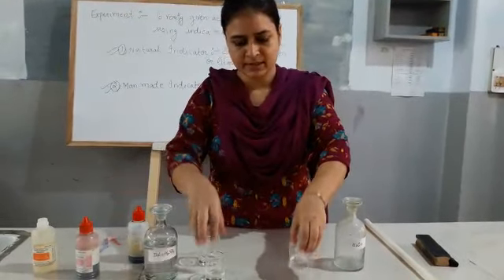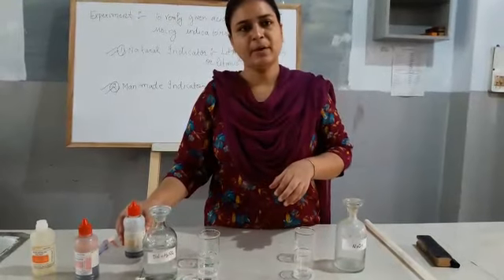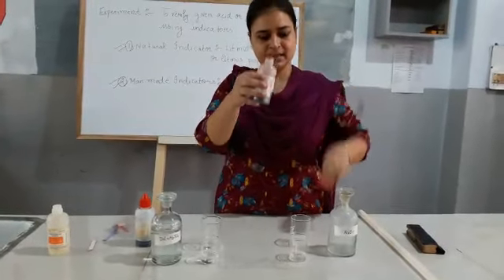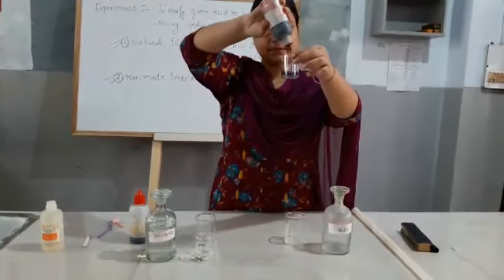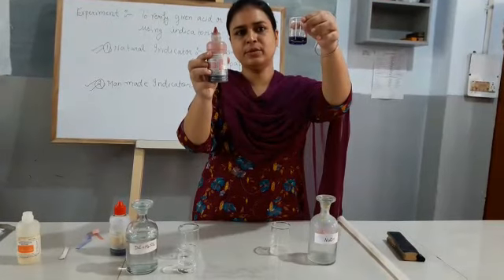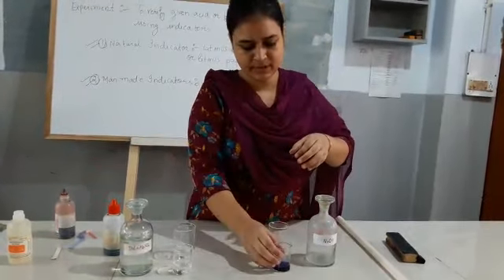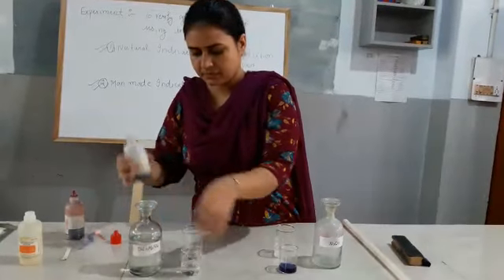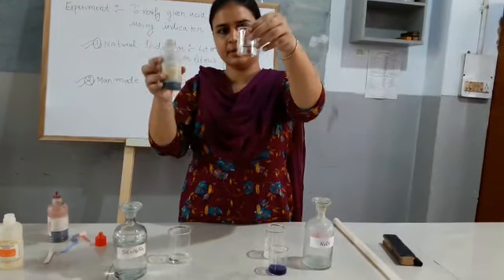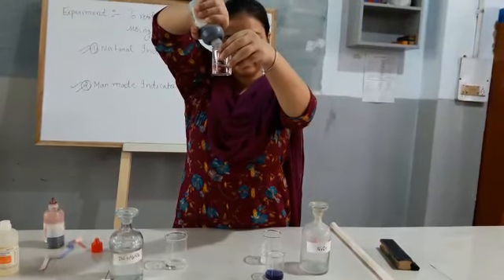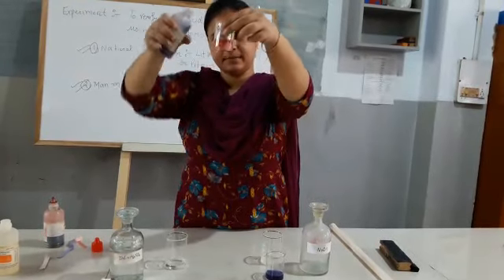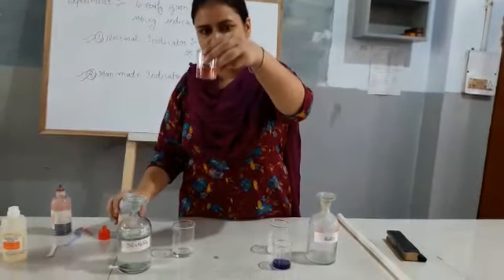Now, I am repeating the same experiment. This is acid, this is base. I am using red and blue litmus solution. I am putting the red solution into our base. As you know, when red litmus solution is used in a base, it changes to blue color. Similarly, when blue litmus solution is put in an acid, it changes to red color. Let us verify it. See, the color changes to red. This verifies that this beaker contains acid.